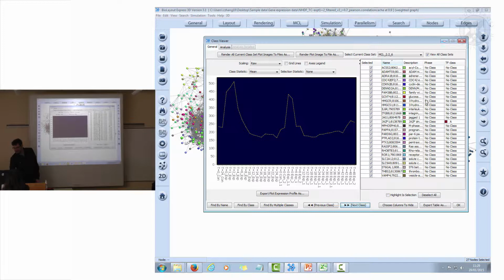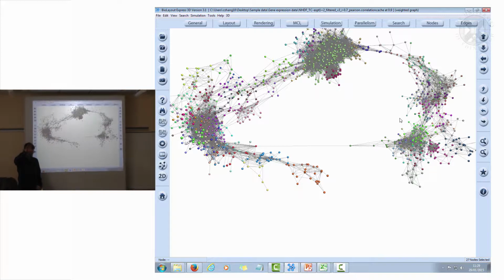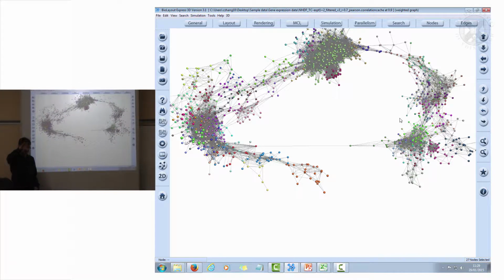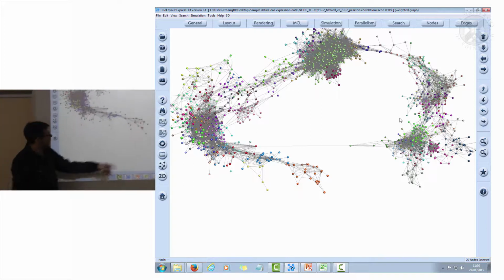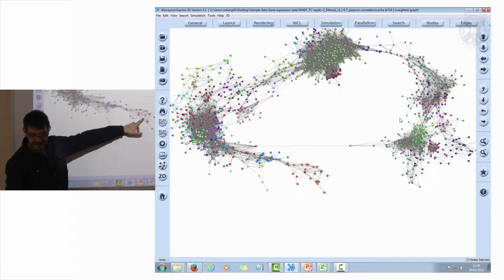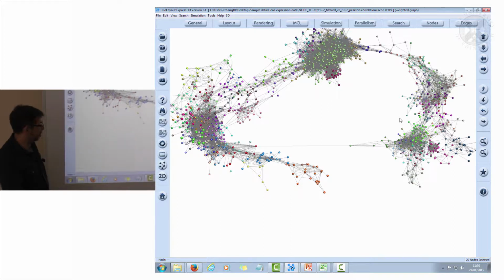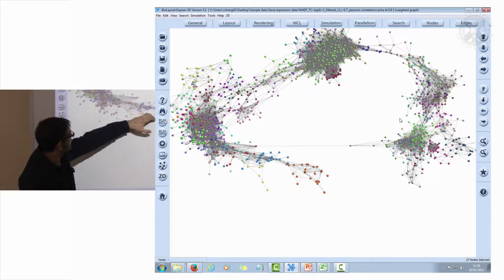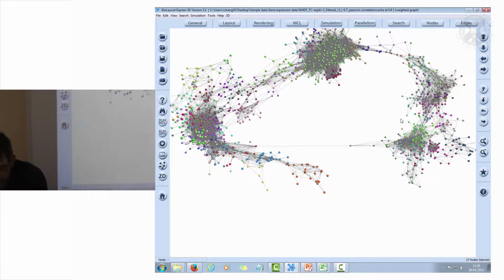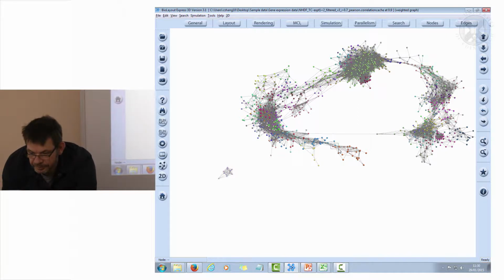So this is the set of genes which are upregulated early on. This almost represents the stationary phase of cells. These are things which are specifically higher in cells which are in G0 than they are in cells which are about to go into proliferation. Then we see this event. Within 1 hour, these guys are turned on. These are the early growth response genes. They are often sitting in open chromatin. They are turned on very early on. And what we're seeing then is the increase in expression. These ones here will probably come slightly later. Well, I'll look at both these two together. Okay.